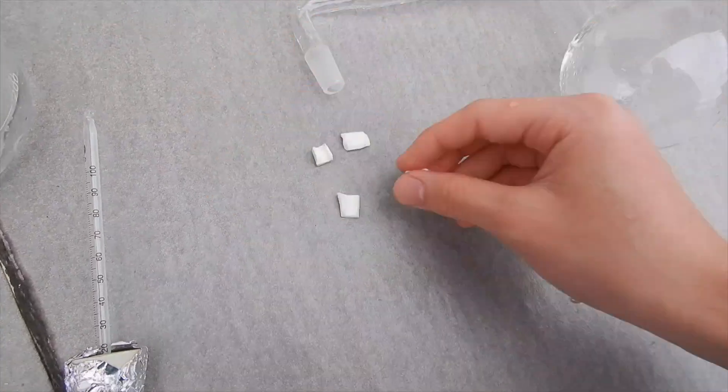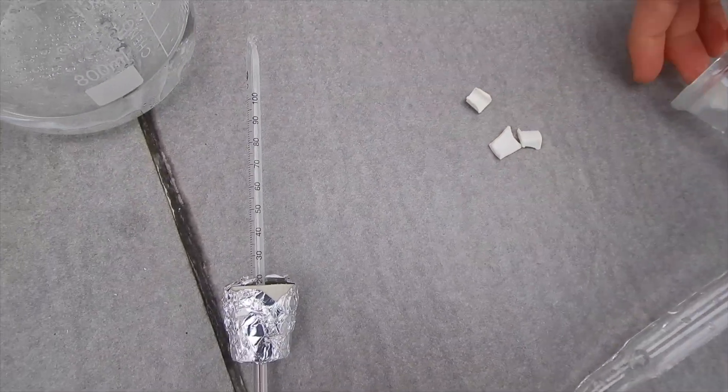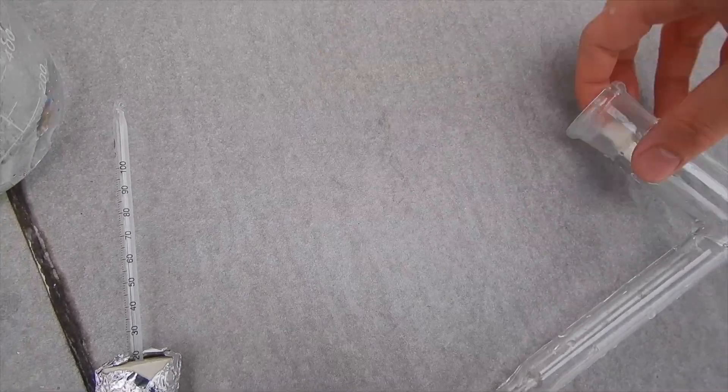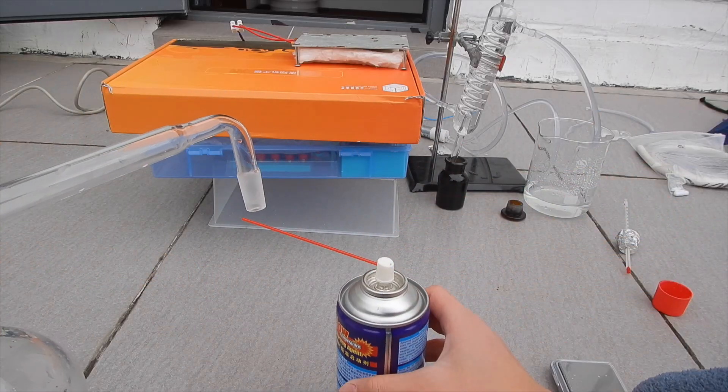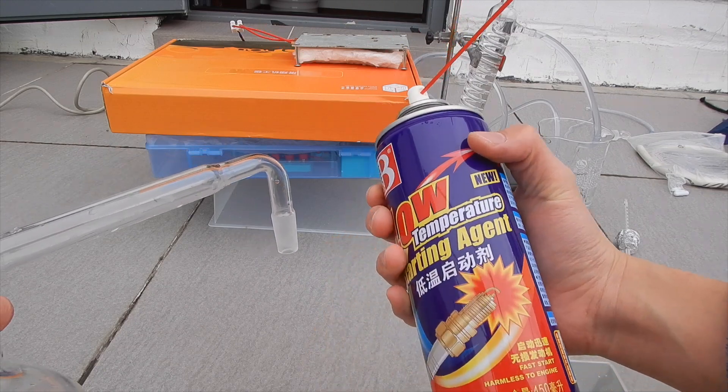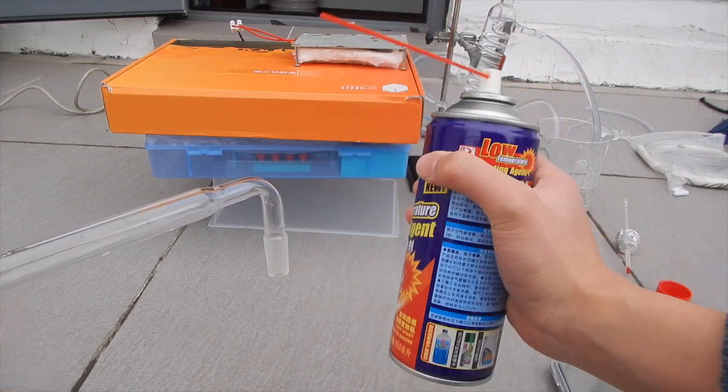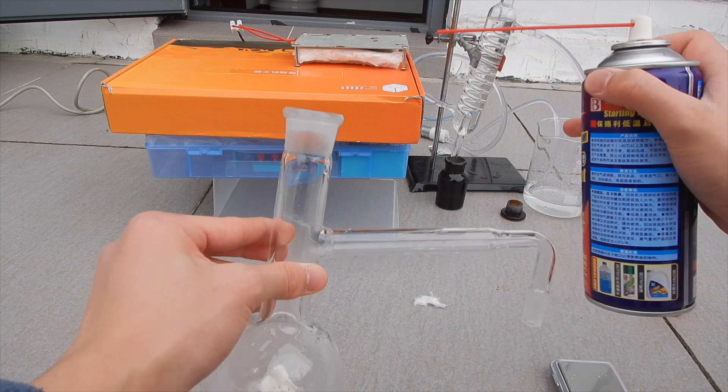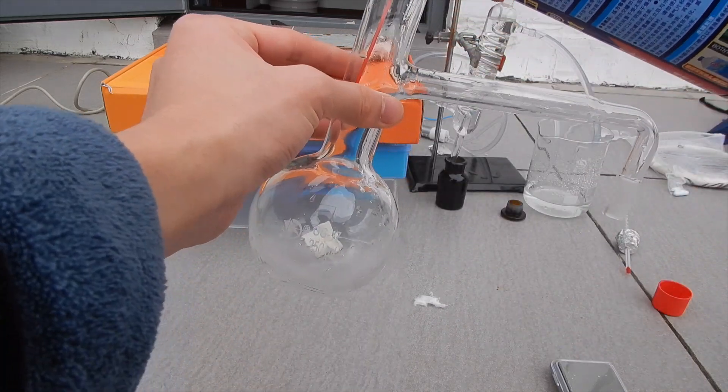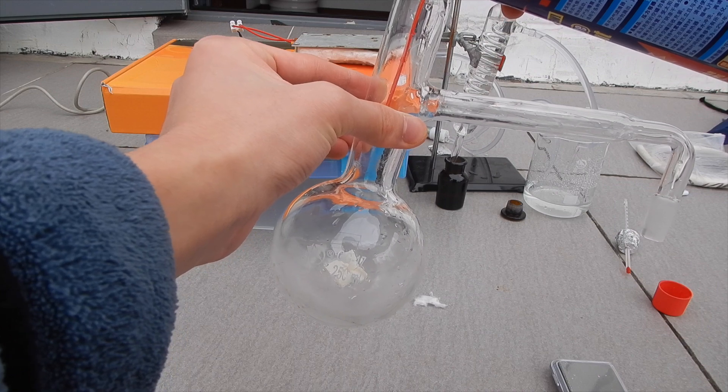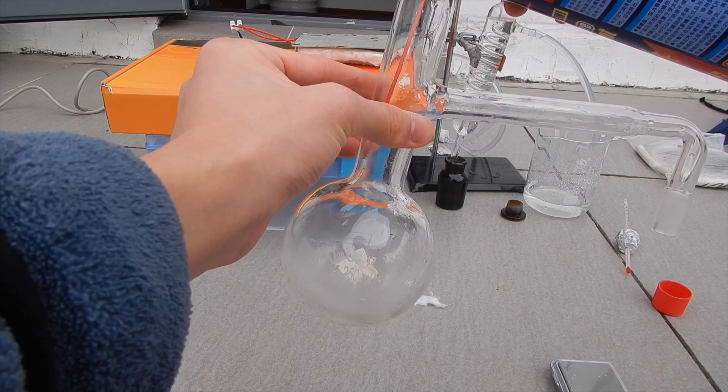I swapped the stirrer for some ceramic pieces, which will act as boiling stones and help control the boiling of the solution. Now I'm ready to do the actual experiment. I grabbed my bottle of car starter fluid and shook it around a bit. This is necessary to equalize the pressure inside the container.